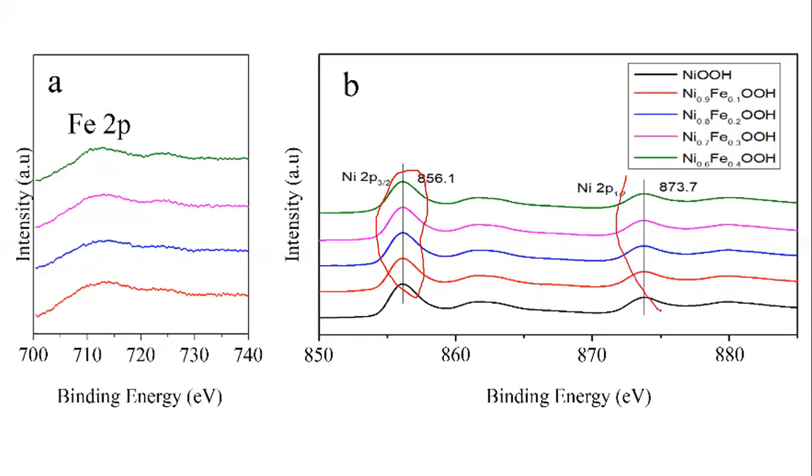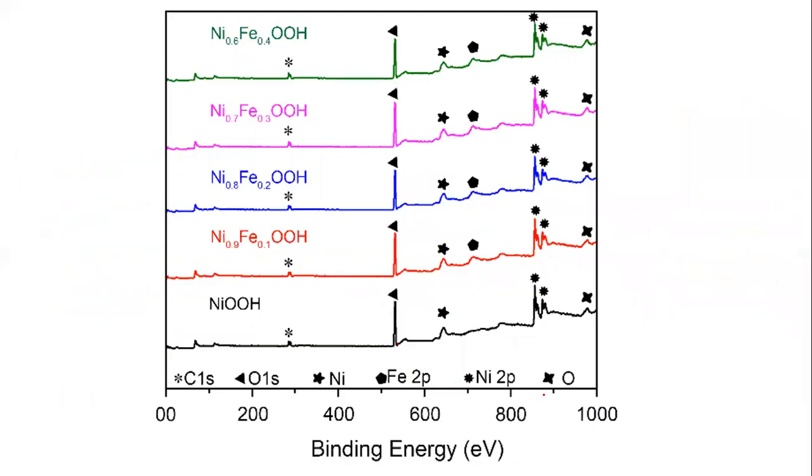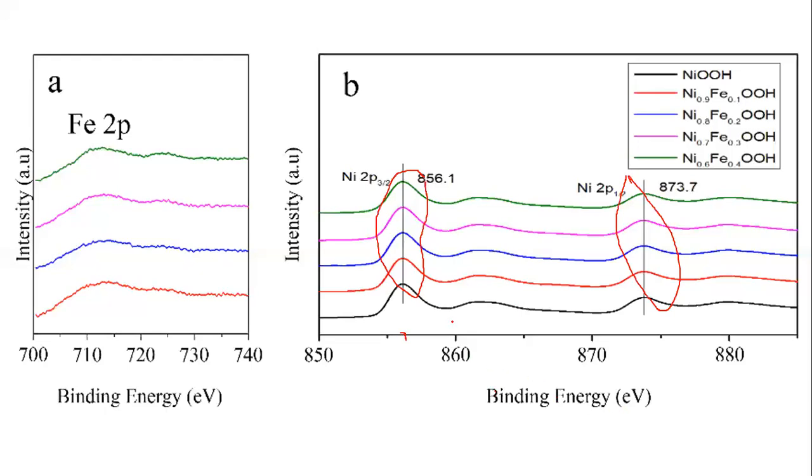Now here, you can also see another peak that, after zooming, I can see very clearly. And the second one, I can see here another peak. This is at 850 and 860, so it's in between 850 and 860. It means 855, 856. Now coming back to the original, 856 is almost over here. But here, this is not very prominent. When it is not very prominent, that is the nickel peaks. Then when I zoom it, I can easily understand that it's a very clear, distinct peak I can observe over here.